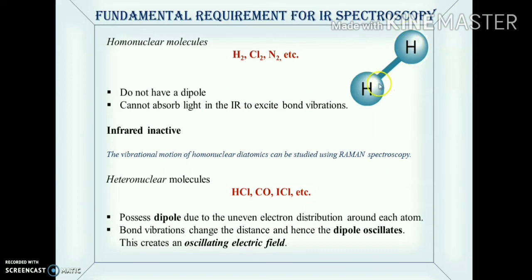Now, when similar atoms have been bonded together by means of a chemical bond, then the question of having an electronegativity difference between the two atoms nullifies, right?